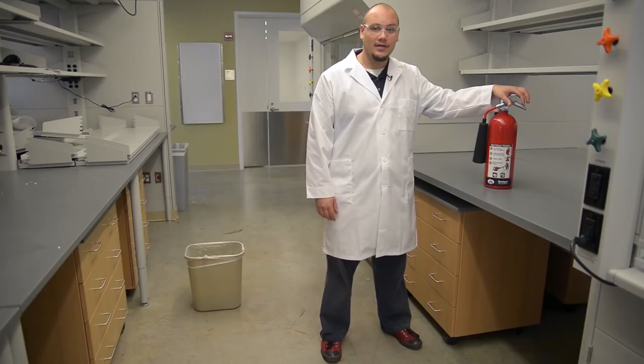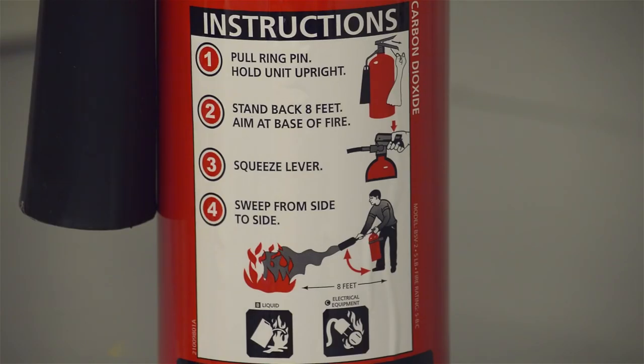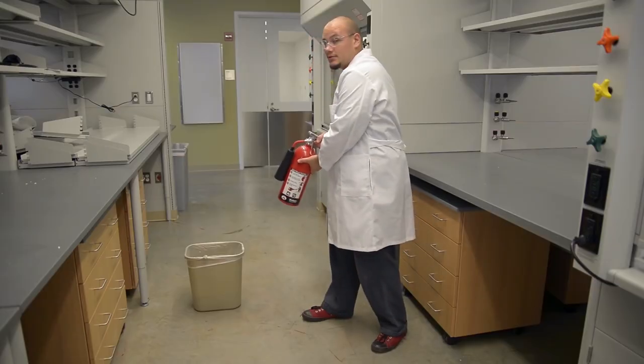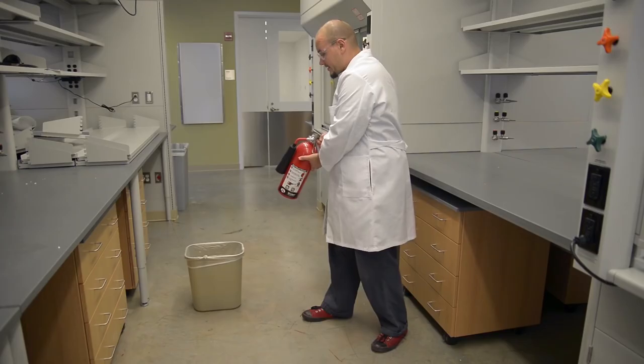If there's a small fire in the lab, you can use the fire extinguisher to put it out. Just follow the instructions on the side and remember the acronym PASS: Pull the pin, aim the nozzle, squeeze the trigger, and sweep from side to side.